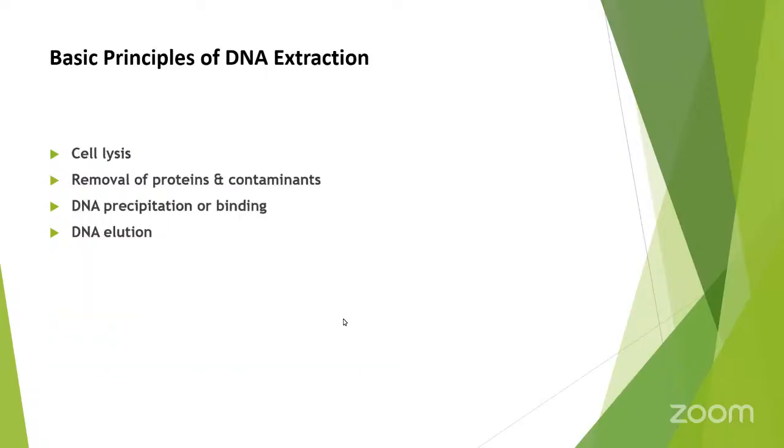Basic principle of DNA extraction. We have cell lysis, removal of proteins and contaminants, DNA precipitation or binding, and then the step of DNA elution.